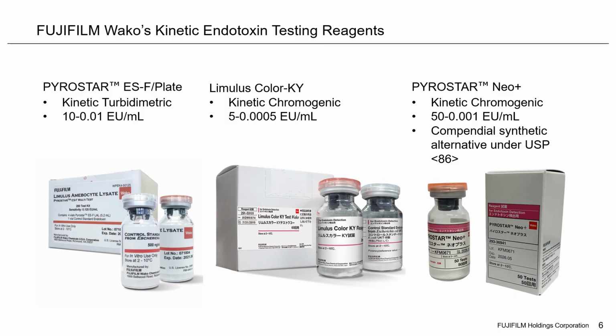Now both of these are Limulus amoebocyte lysate reagent. Both of these fit the definition of an endotoxin testing reagent according to USP 85. However, the United States Pharmacopoeia has just voted to include a new chapter on bacterial endotoxin testing. That's chapter 86. And this chapter allows for synthetic reagents to be used.